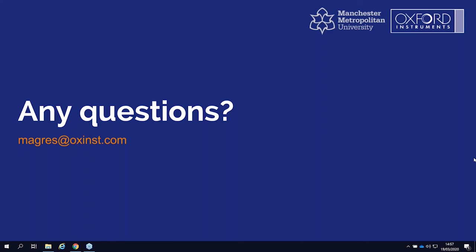Thank you very much. I think we are rapidly running out of time. We've had a couple of comments about the magnet temperature. Chris Thompson was wondering what temperature the magnet runs at. Andrew Hall asked more specifically, given that the magnet temperature is fixed, does that mean that the sample is at a different temperature in the cell than it is in the reactor?